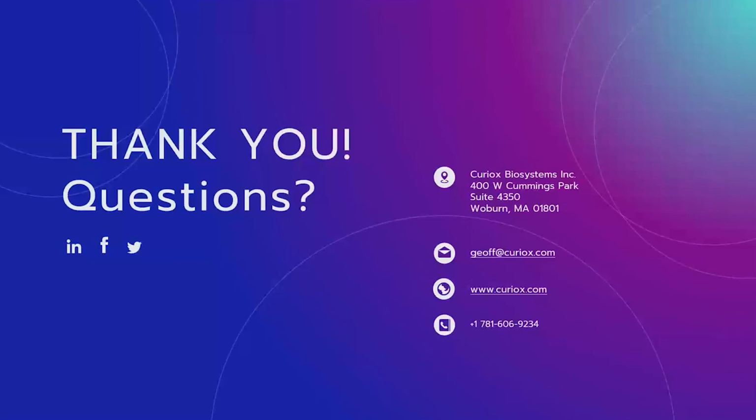No problem. Great. Thanks. So I have one question. I really appreciated your explanation of cell hashing, how it works, how we think about the concentration of cells and how many cells per droplet. I really recommend folks to go back and look at that if you need a refresher on how cell hashing works. Just a follow-up with that: when you started using the Laminar Wash system, did you start to see any improvements in doublet or even empty droplet ratios? Because we have customers that have reported that. So I was just curious if you're seeing similar results.